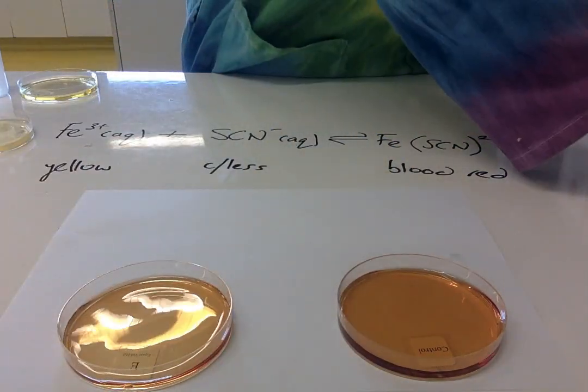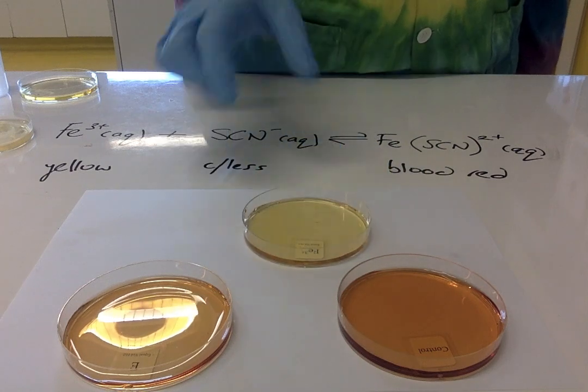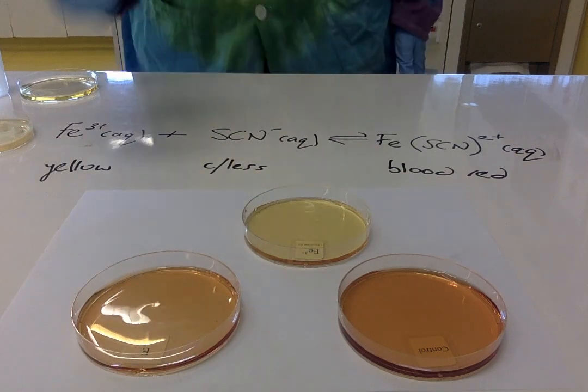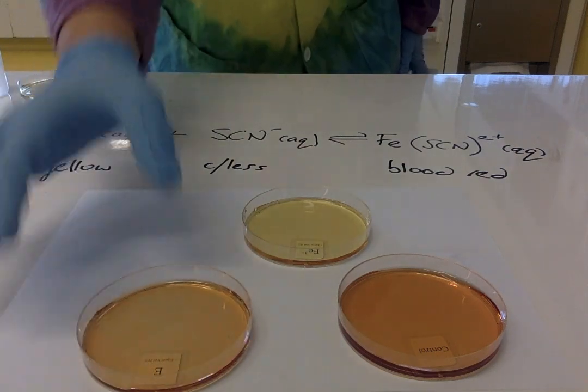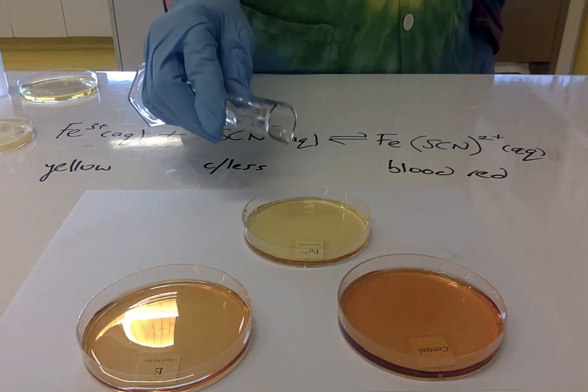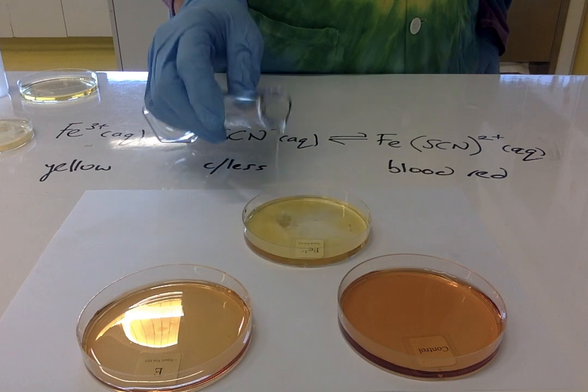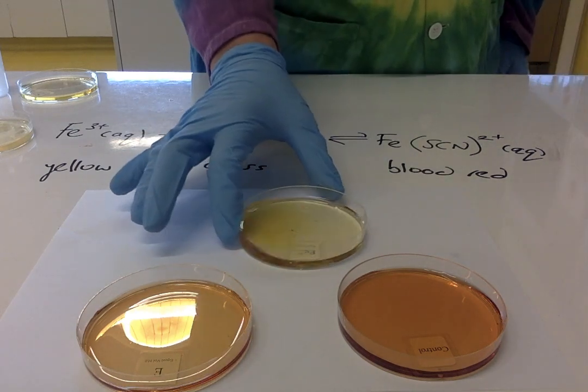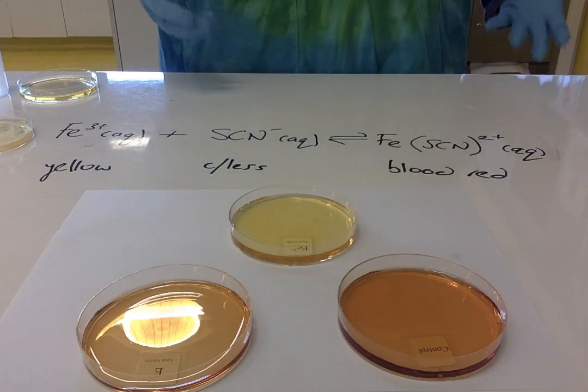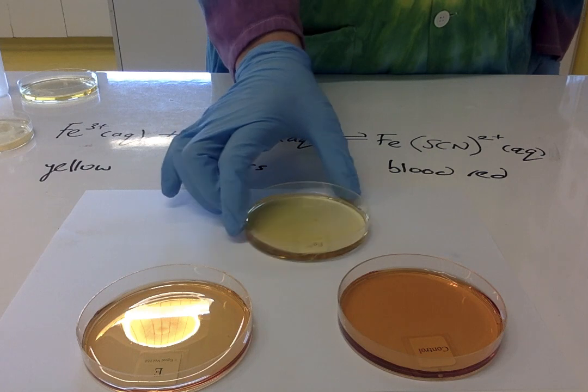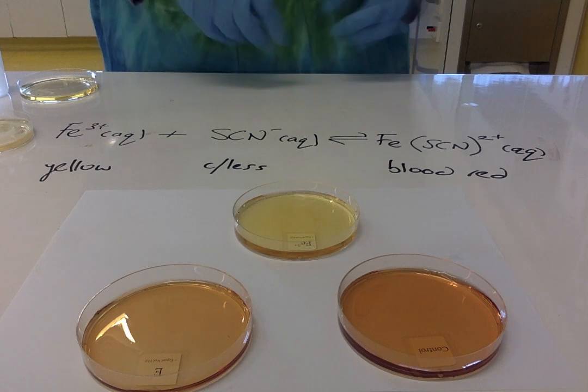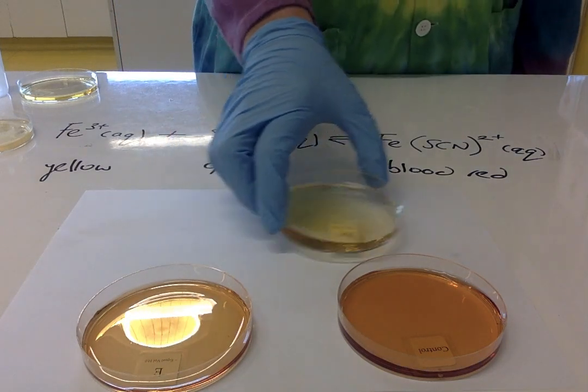Part of this test is we've got just Fe3+ by itself, which is yellow. What I'm going to do is add some water to the yellow. Effectively, it's just slightly lighter yellow. All we've done is—this is not in equilibrium, it's just iron(III) nitrate on its own—I've just diluted it, so the color itself becomes lighter.